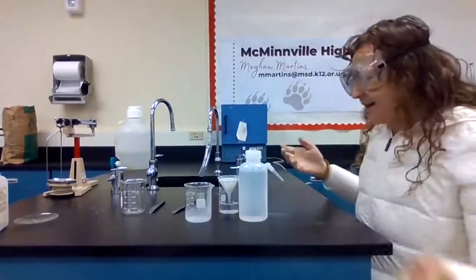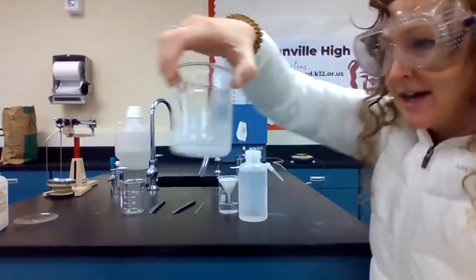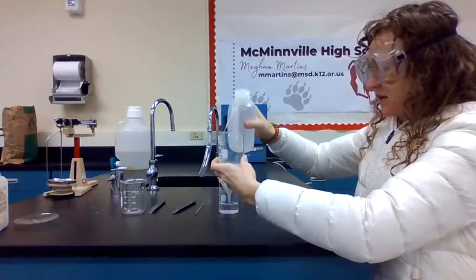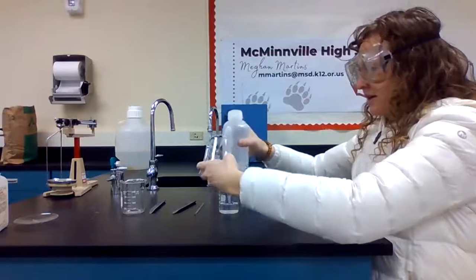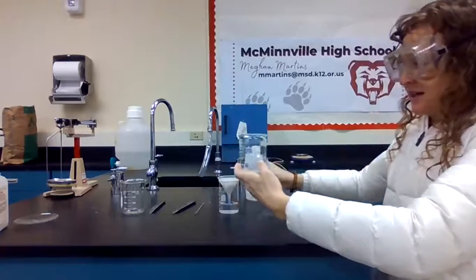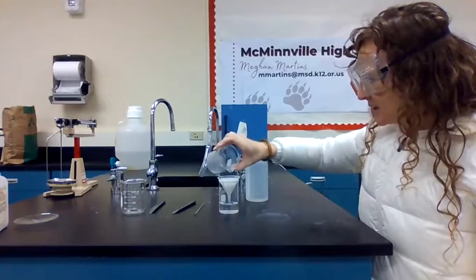All right, here we are at the end, and you can see my jar. Notice that it's not looking super clear anymore, and that's all solid that we want to collect. So again, even though you've just been sitting here for hours waiting for your sample to dry, you want to add a little water and make sure you get all of that solid out and drain through. And this is another important place for you to realize that the amount of water really doesn't matter because it's going to go through our filter.